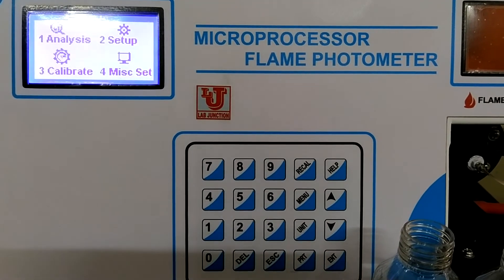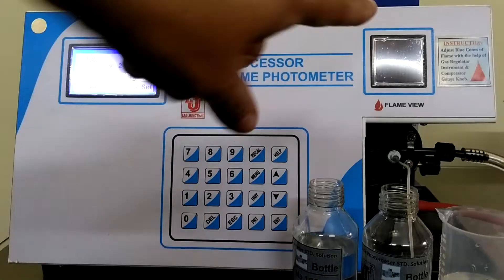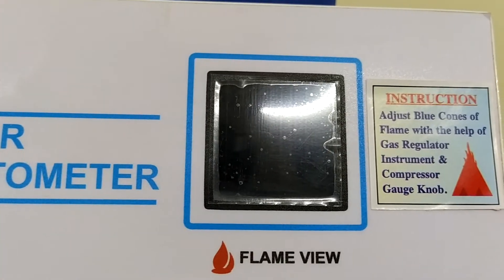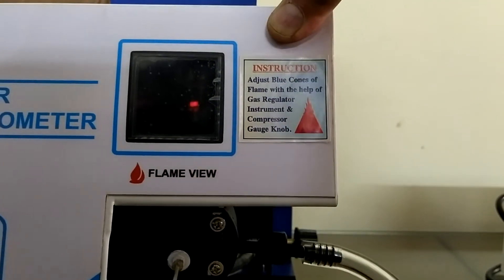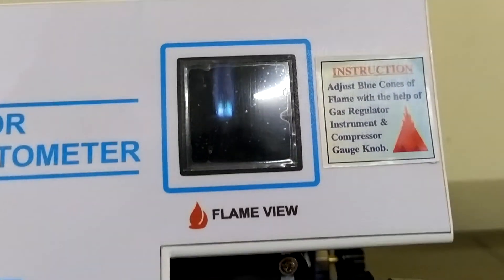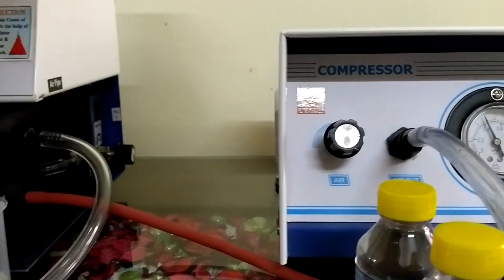Now, if the setup is ready and you switch off the gas cylinder supply, the flame goes out. Switch on the gas cylinder supply again and press the manual ignition. Automatically, the same flame is set up — there is no need to set up the flame again and again, as long as you do not disturb the gas regulator of Unit 1 or the air regulator of compressor Unit 2.